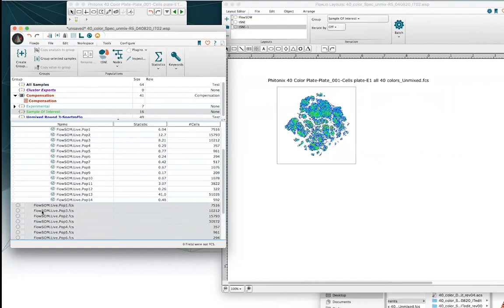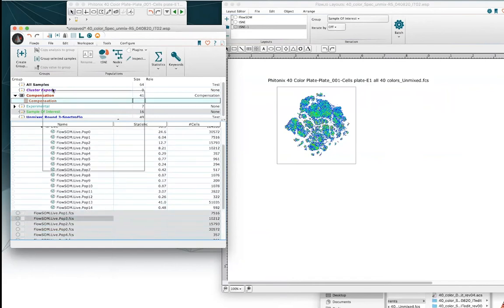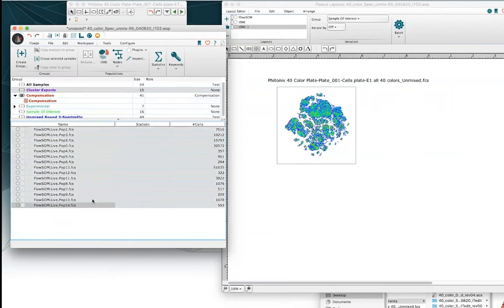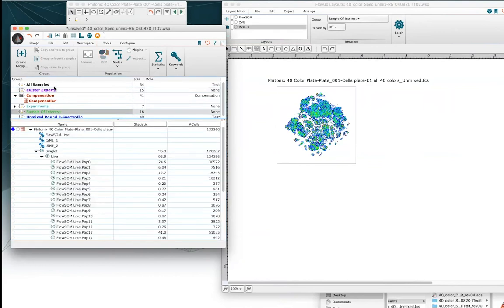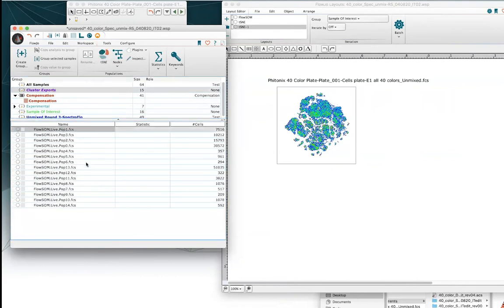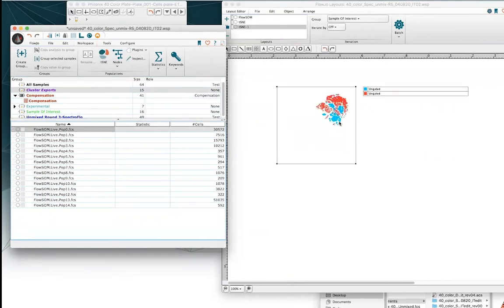It will automatically load into the group that we've currently selected, but we want that in its own special group. That's important because the way iteration works is we perform iteration on a particular group of samples. So once you've got your samples into their appropriate group, reselect that group, and we're going to overlay just with the very first FlowSOM population, which is FlowSOM population zero. Now we should be able to see where t-SNE sits with regard to our FlowSOM population.